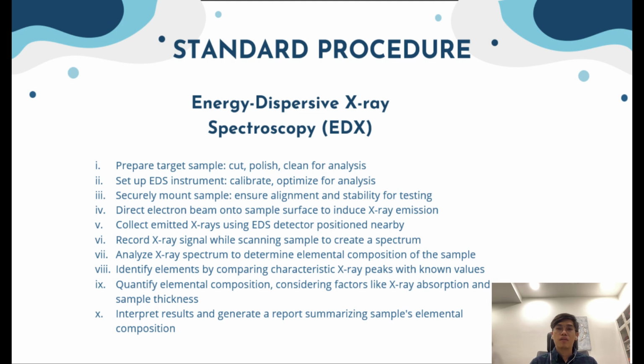Fifth, collect emitted X-rays using EDS detector positioned nearby. Sixth, record X-ray signal while scanning sample to create a spectrum. Seventh, analyze X-ray spectrum to determine elemental composition of the sample.